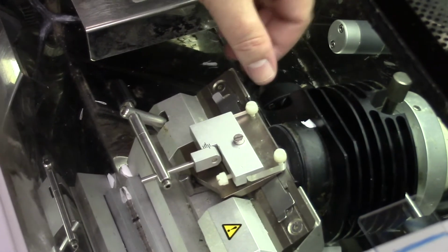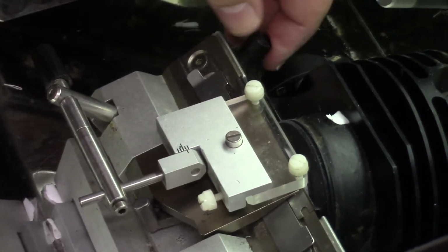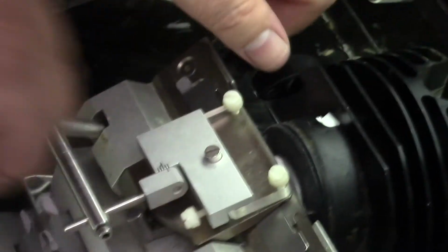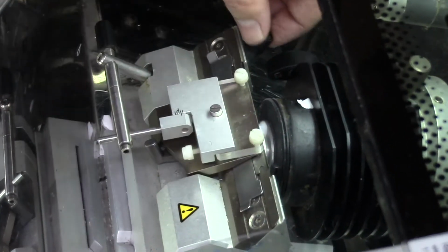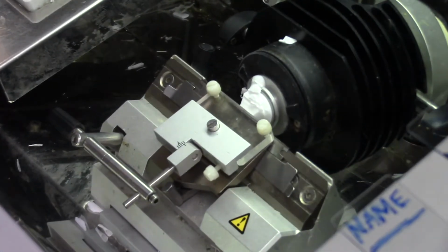So can you see how, as I adjust that, the whole roll guard is moving further and further out over the knife? I want it to be just barely over the edge of the knife. This little knob adjusts the angle of the glass. This one right here. So I'm just trying to make sure it's lined up with the edge of the knife blade. So let's try to take a few more sections.